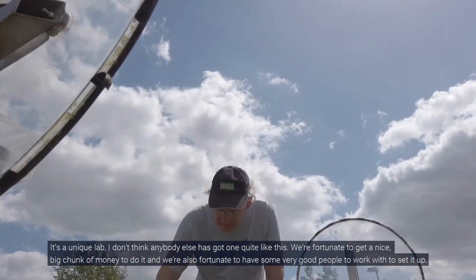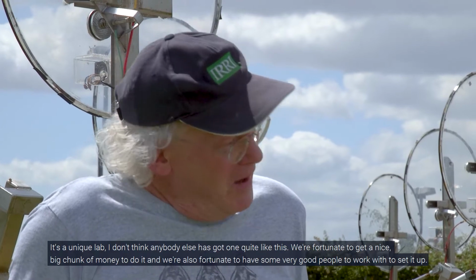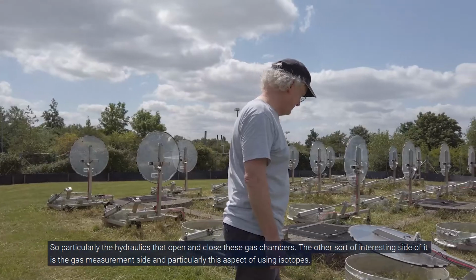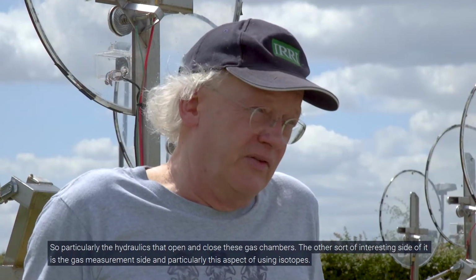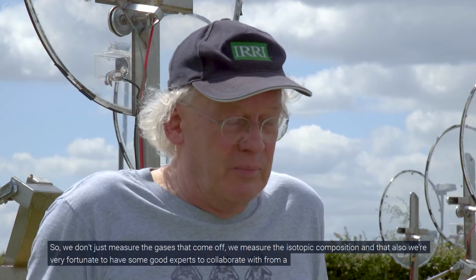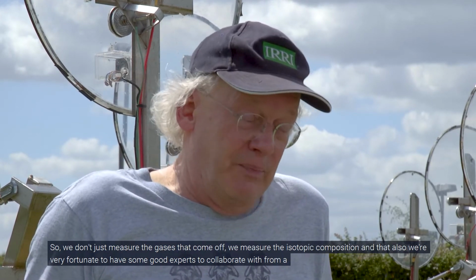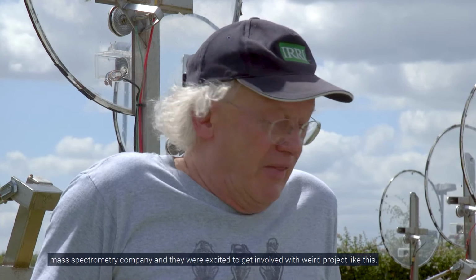It's a unique lab. I don't think anybody else has got one quite like this. We're fortunate to get a nice big chunk of money to do it, and I'm also fortunate to have some very good people to work with to set it up. So particularly the hydraulics that open and close these gas chambers. The other interesting side of it is the gas measurement side, and particularly this aspect of using isotopes. So we don't just measure the gases that come off, we measure the isotopic composition. And that also, we were very fortunate to have some good experts to collaborate with from a mass spectrometry company. And they were excited to get involved with a sort of weird project like this.